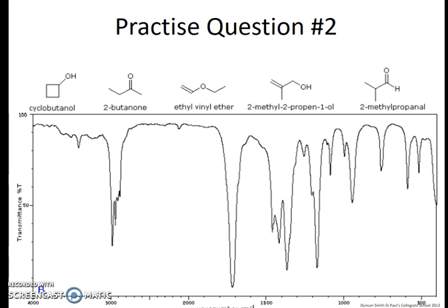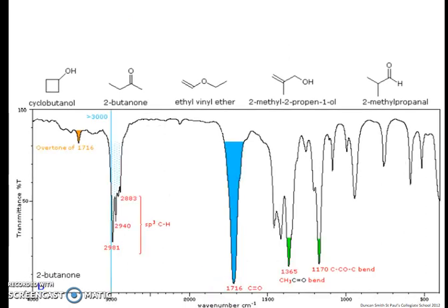As I have already identified the aldehyde, and there's no shoulder peak at about 2750 wave numbers, I would expect that this will be butanone. And so it is.